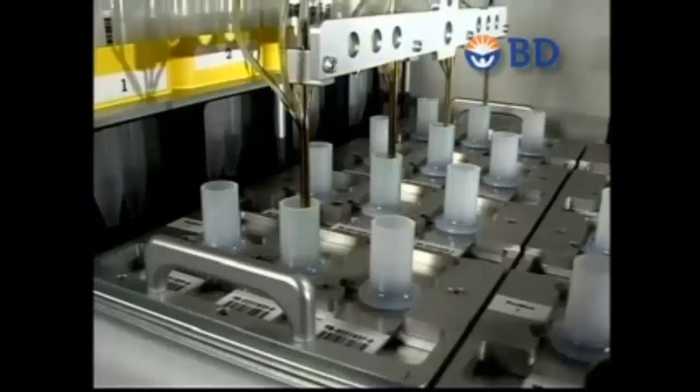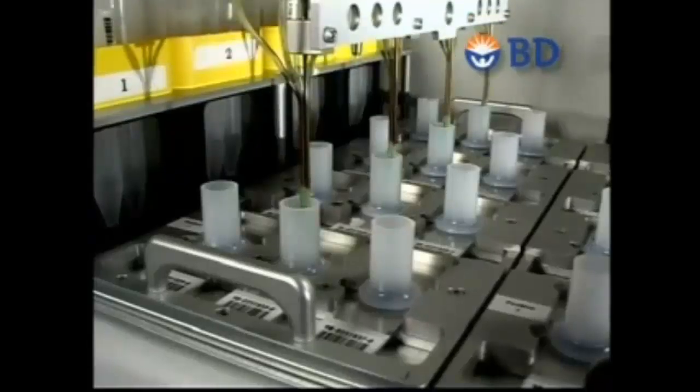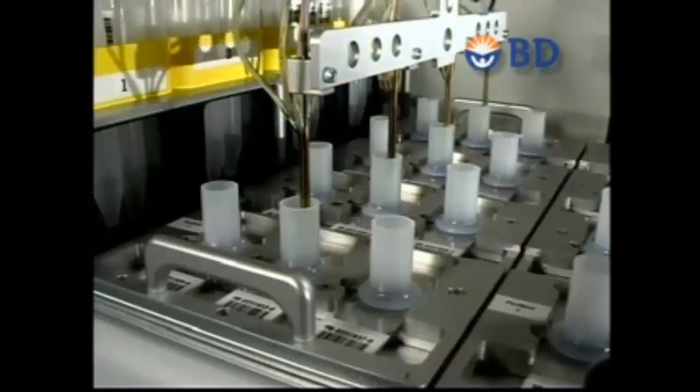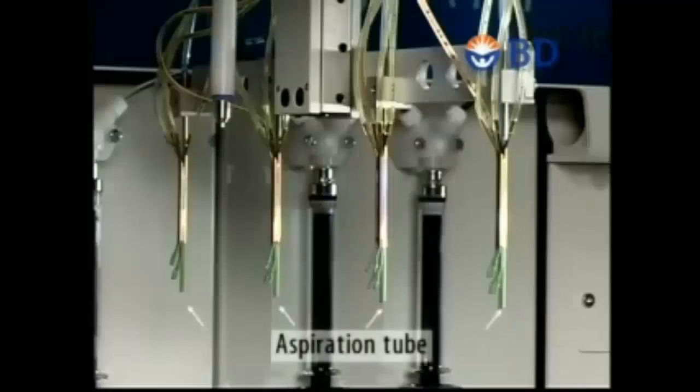Standardized discrete staining eliminates another variable from the preparation process. Stain intensity and tint remain consistent, and the stain never needs to be filtered or reused. Stain bundles have 4 tubes to dispense the staining reagents as appropriate. The longest tip is the aspiration tube, which vacuums excess waste and stain into the waste container.